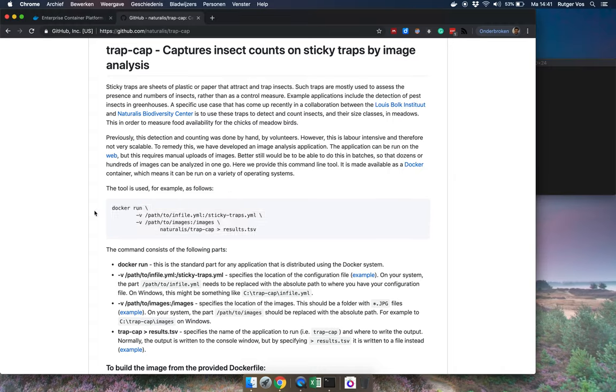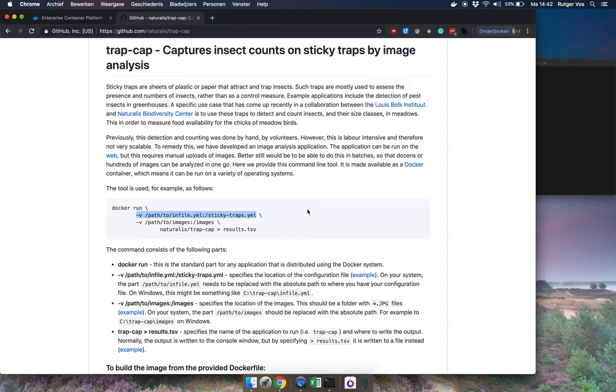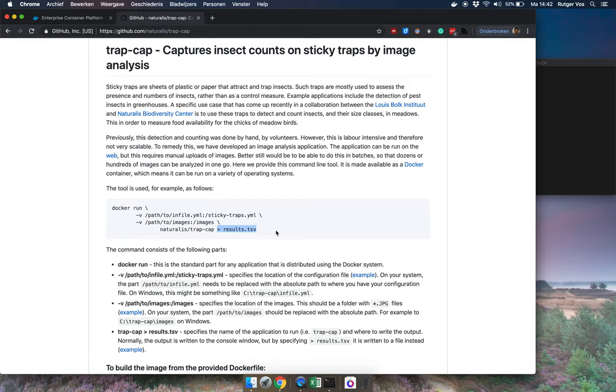Okay so we have that and then here's what the command looks like. First it starts with docker run, that's always the same, that's just part of the docker system. Then there's two parameters that we have to give it: the first one is the location of our configuration file as I'll show you in a minute, and then the next argument is the location of our folder with the photos of our sticky traps. And then the fourth line gives the name of the tool, naturalist slash trap cap, and then where we want to write the results. So the results are going to be in tabular form, it's going to be tab separated tabular data which you can open in Excel or in R or something like that. And with this greater than symbol and then a file name, this is how it's written to the file.